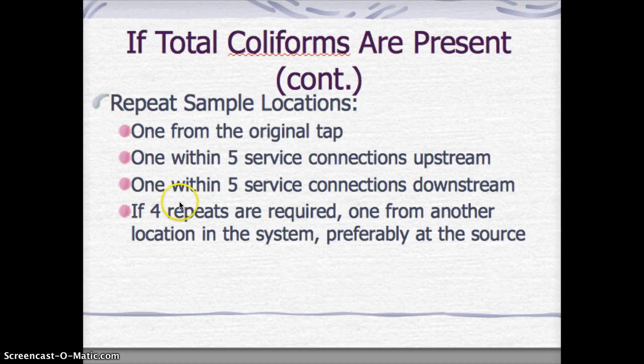So this here on the repeat samples is very important to the activity that you're going to be doing on completing a chain of custody. It's exactly what's in the scenario, basically, that there has been a positive sample, and how would you do the follow-up or the repeat samples, and then you'll get to represent that on the chain of custody forms, excuse me.